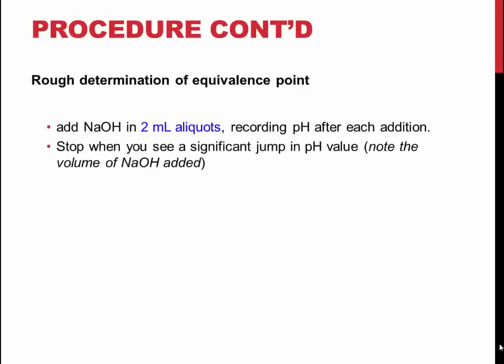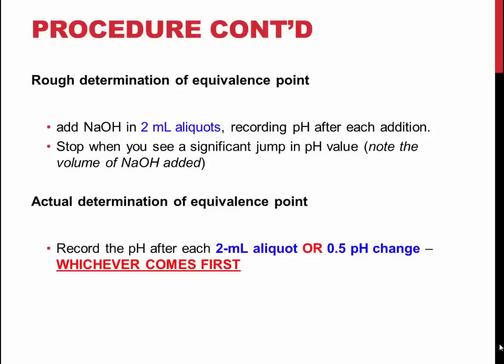Add sodium hydroxide in 2 mL aliquots and record the pH to two decimal places. The pH should be recorded after each addition or after a 0.5 change in pH, whichever comes first. This should give you enough data to plot your titration curve from which you can obtain the concentration of acetic acid in the vinegar you analyzed.